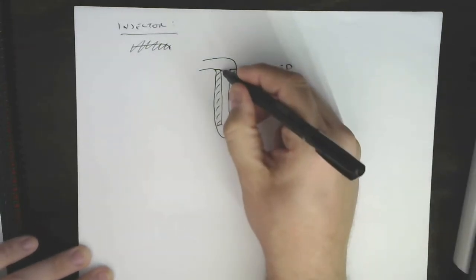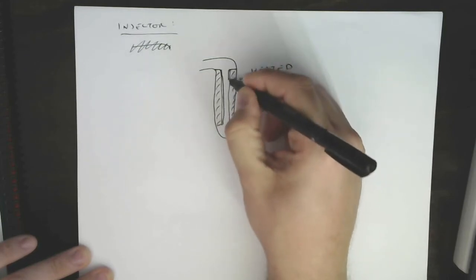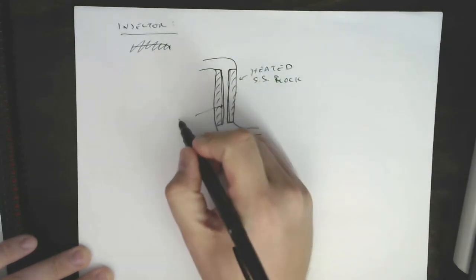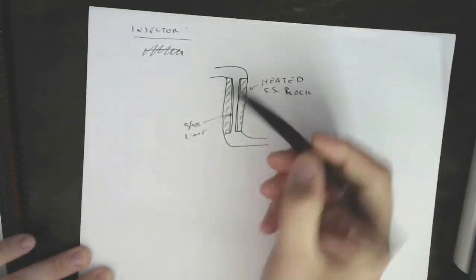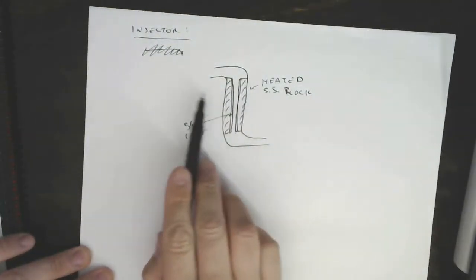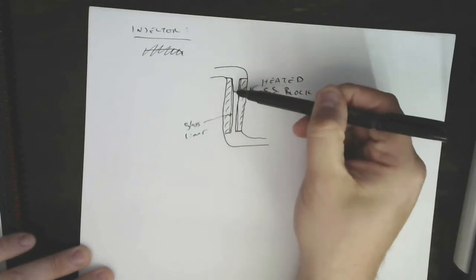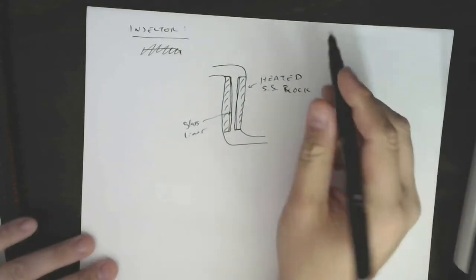That heated stainless steel block is lined on the inside here with a glass tube. So this is like a little glass-lined compartment, we'll call it a glass liner. We're looking at this thing in cross section, right? If we had a stainless steel cylinder and you put a tube in the middle and cut it down the middle, the walls would look like they were made of glass. So we have this glass-lined chamber.